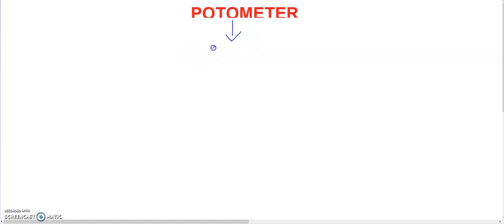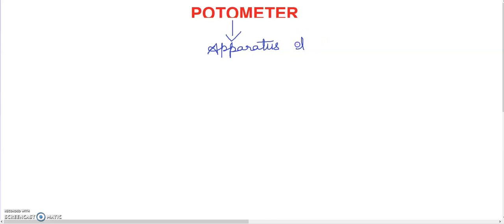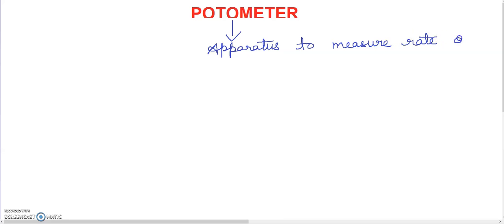Basically, it is an instrument or apparatus — you can say this is the apparatus which is used to measure the rate of transpiration, or you can say the rate of water uptake, in a cut shoot.